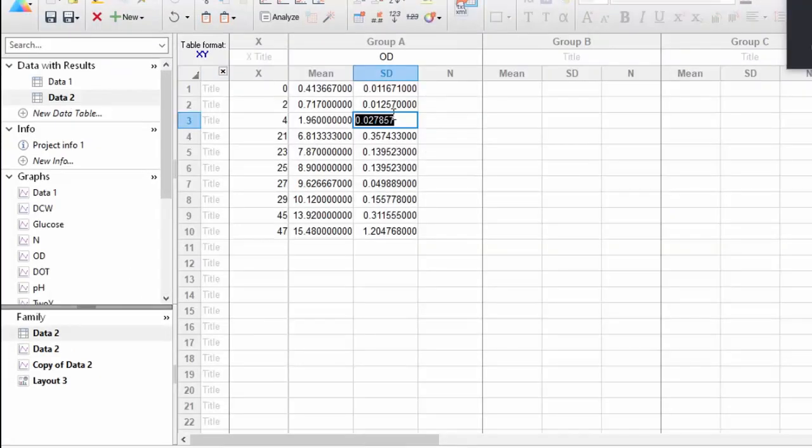So this is the OD, imagining that I want to have OD as a tertiary axis because it goes up to 15. So I have that data separately in a project file. And then a new data would be created.